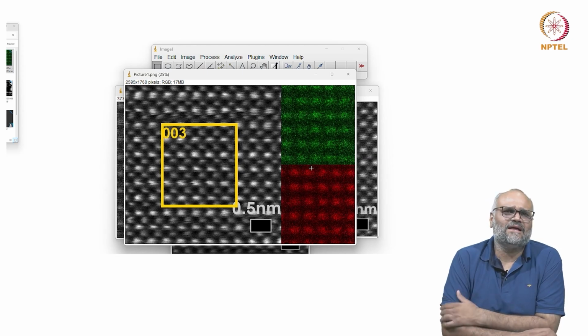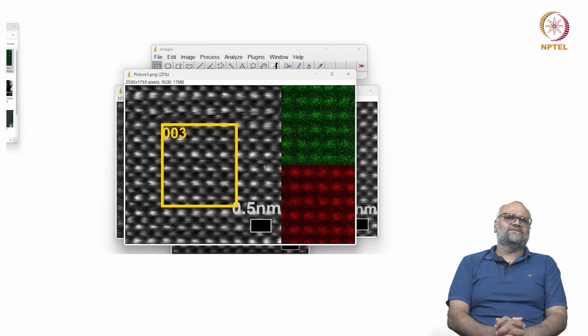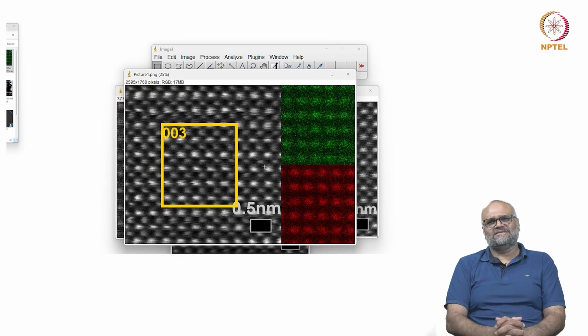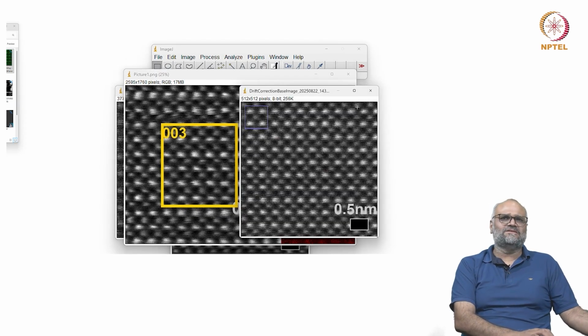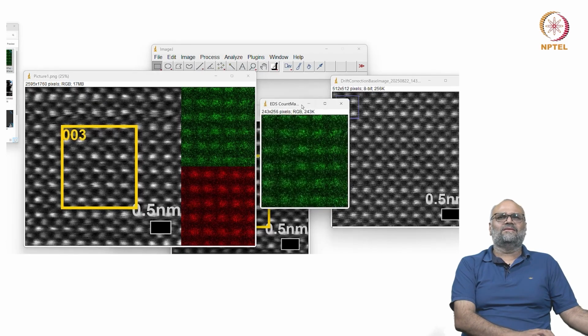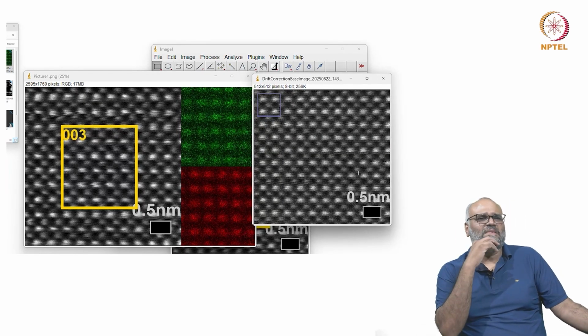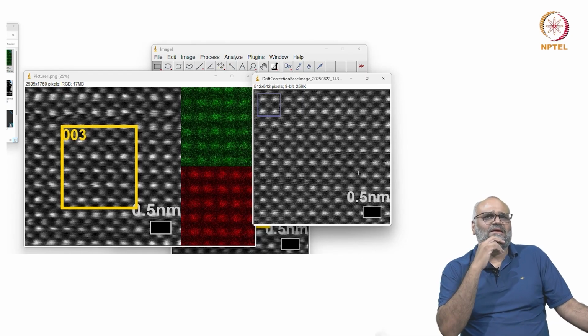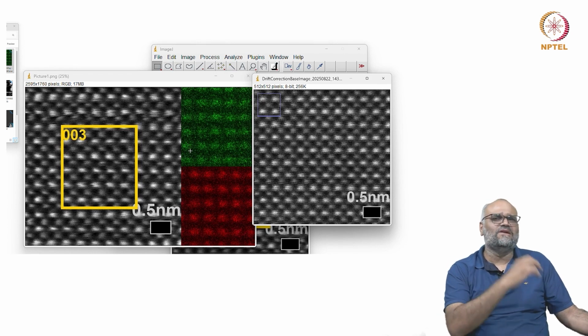When you're drawing comparisons, let us say you have two different conditions from which you're trying to record EDS data, and you have an image like this and you're comparing it with another image from a slightly different region, and it is not always sure that you might actually be recording the data from the same field of view.